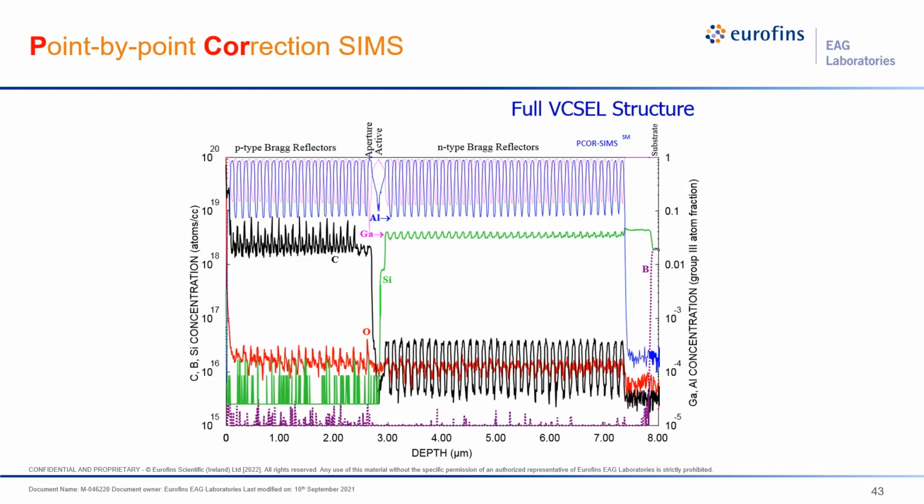Right. And then, of course, for VCSEL, this multi-layer quantum well or superlattice structure, you really want to know the composition of the aluminum gallium arsenide, and you are also interested in the dopant concentration.